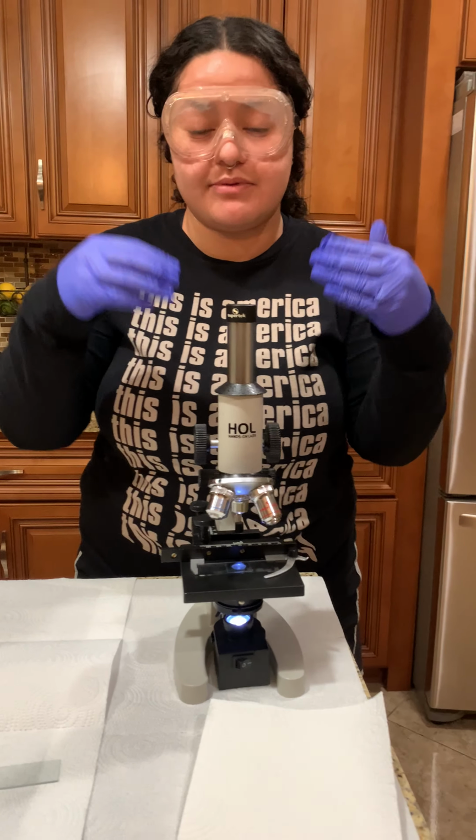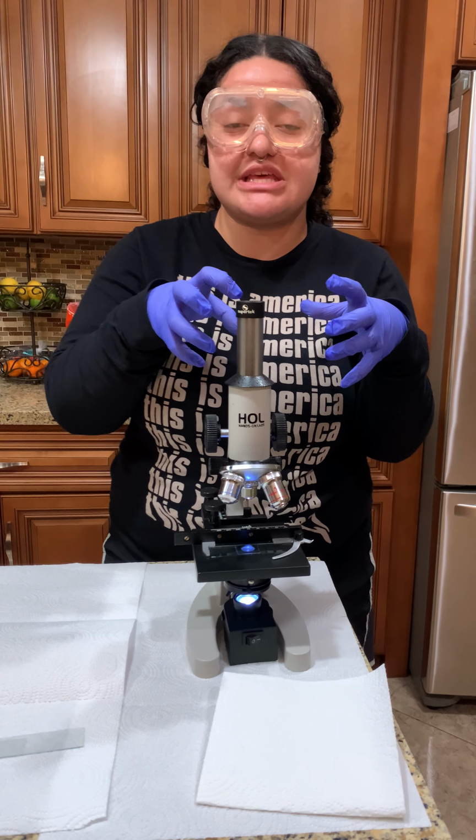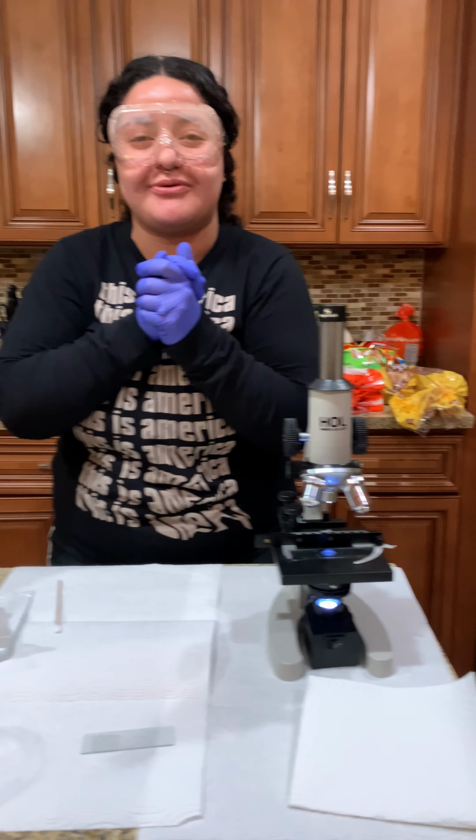And then now I'm able to go ahead and observe it through the ocular lens to see my cheek cells. Once I'm able to see that, I'll go ahead and take a picture and put it into my lab report. Thank you.